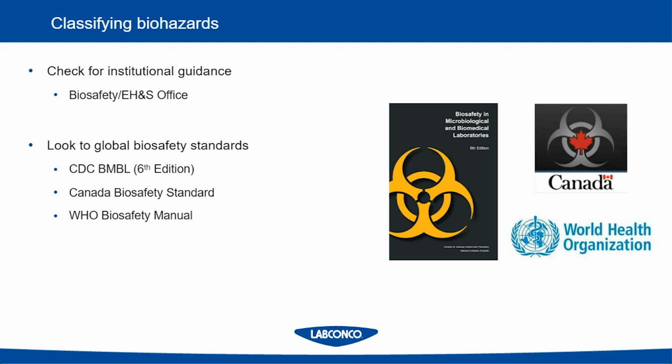This is really a complete guide to not only how you need to classify your biohazards, but what steps and what things you have to have in place in your laboratory to work with various hazards. This book will also outline what BSL level is required for your specific risk group of biohazard. Canada has a very similar standard, and the WHO has a general biosafety manual as well.